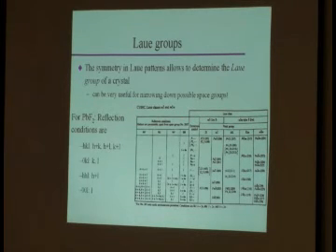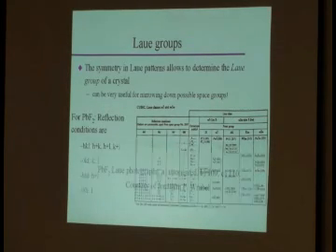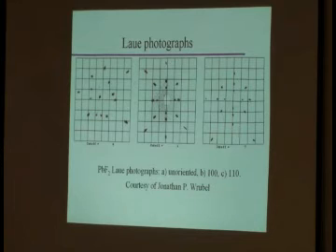It also gives you the full symbol, which is 2/m 3bar and 4/m 3bar 2/m. Those are the only two Laue classes in cubic crystals. Okay? Now, with that knowledge, let's look at these real-life patterns and figure out whether PbF2 is m3bar m or m3bar as a Laue class.